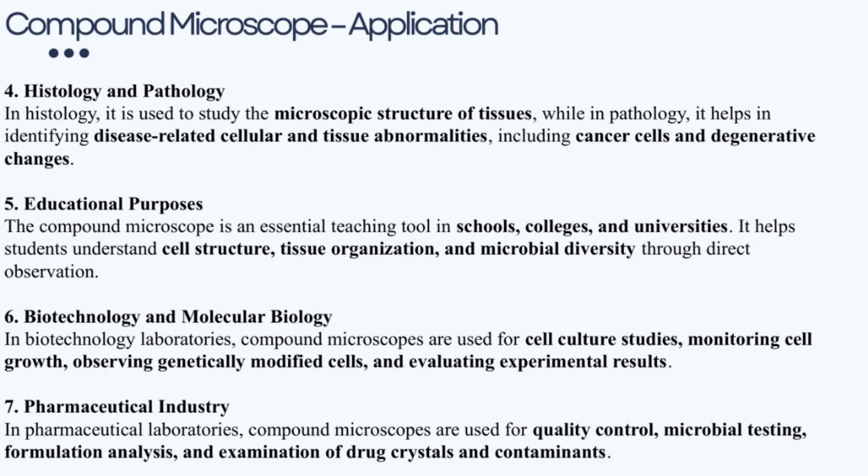In biotechnology and molecular biology labs, the microscope is indispensable. It allows scientists to study cell cultures, monitor cell growth, observe genetically modified cells, and evaluate experimental outcomes. This detailed visualization is crucial for advancing research and development in these fields.